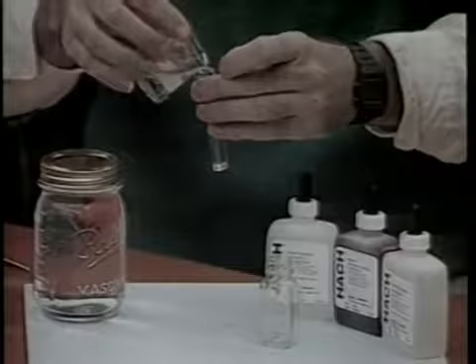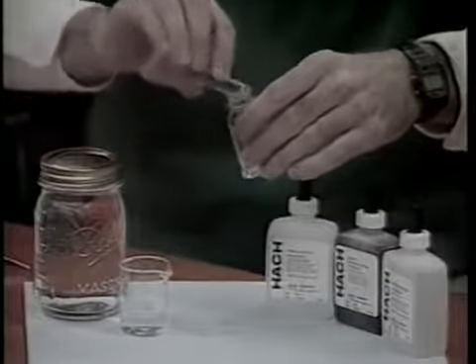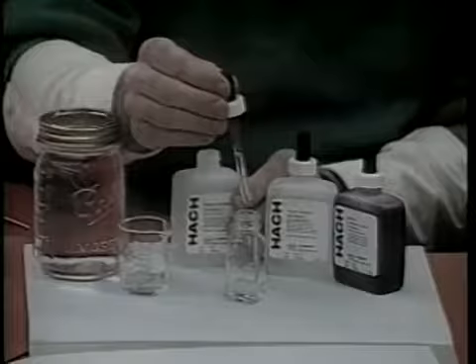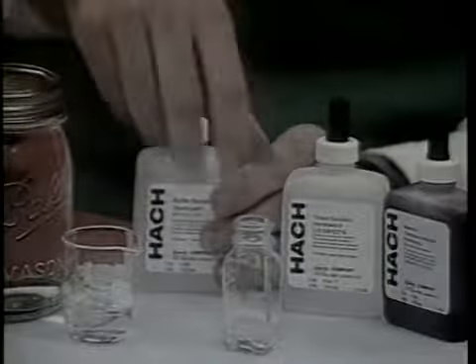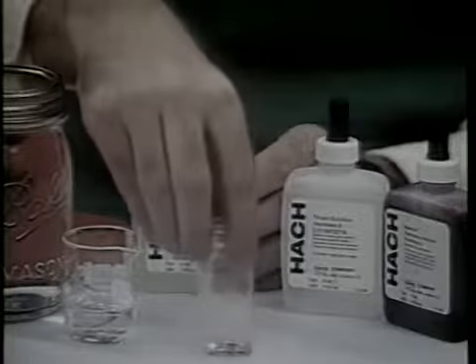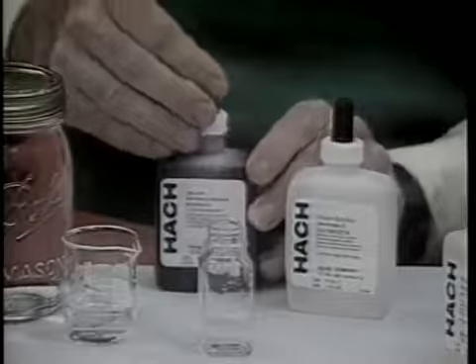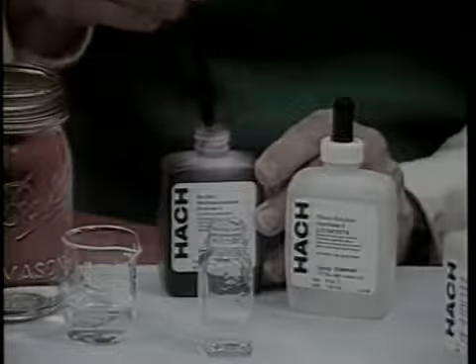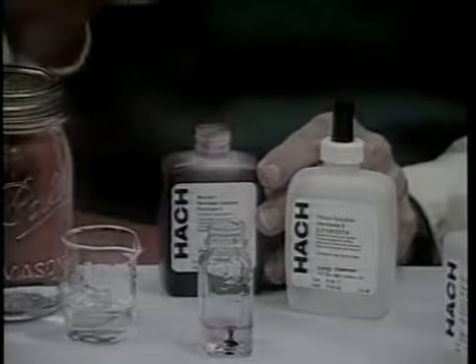Rinse a plastic measuring tube provided with the kit with the water to be tested, then fill and pour the contents into the mixing bottle. Now, add 3 drops of buffer solution to the mixing bottle and swirl to mix. Then, add 1 or 2 drops of hardness indicator solution to the mixing bottle and swirl to mix. The sample should turn pink or orange.